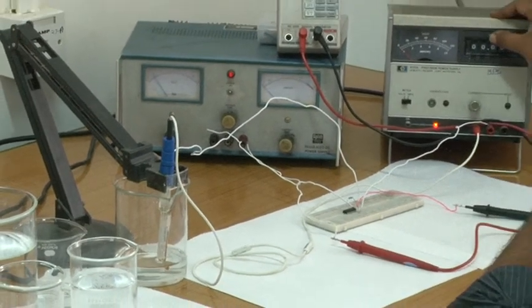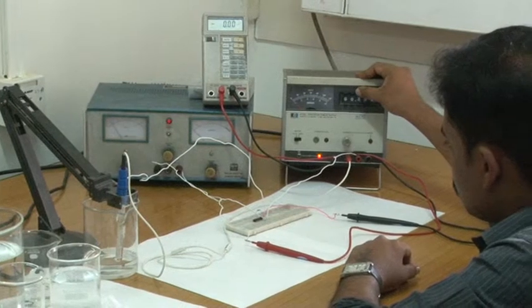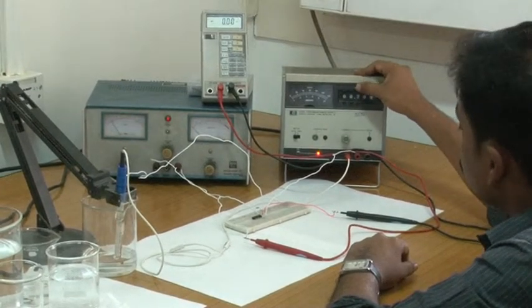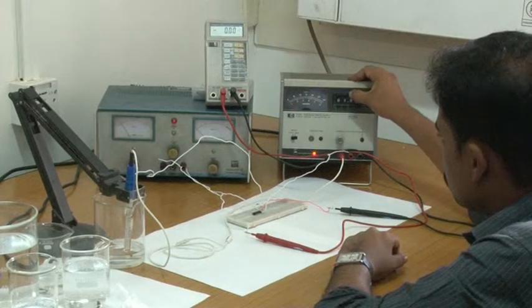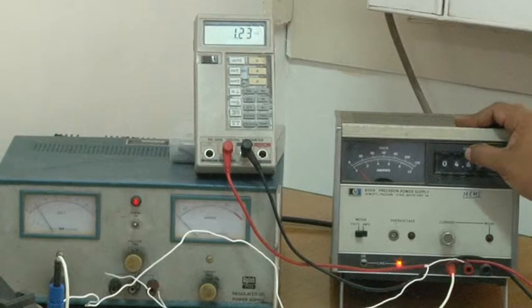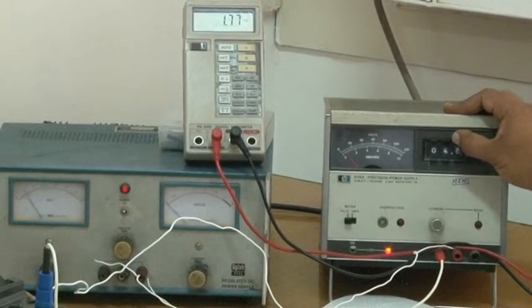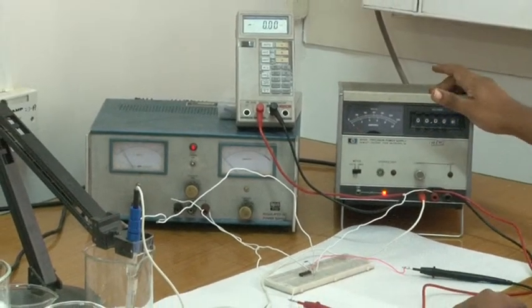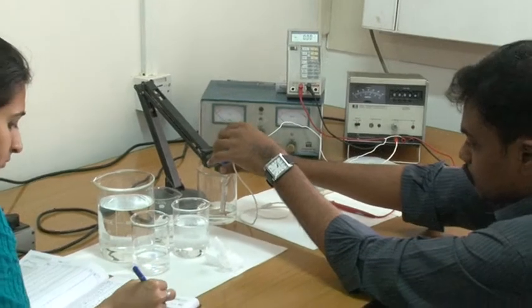Now we change the setup for pH 10 measurement. We repeat the same procedure as we did for pH 4 and pH 7. The measurement with all 3 pH solutions is now over. We have measured the drain current by applying the reference voltage through the reference electrode.